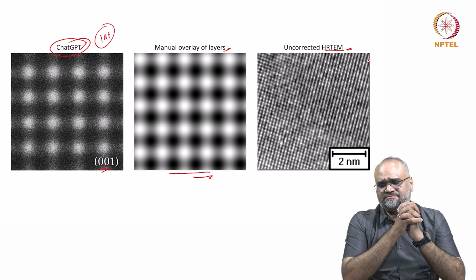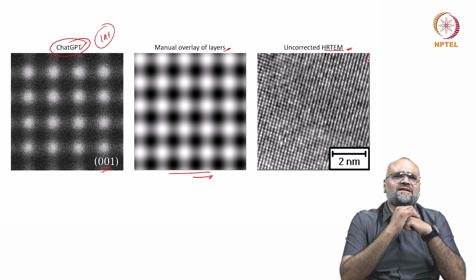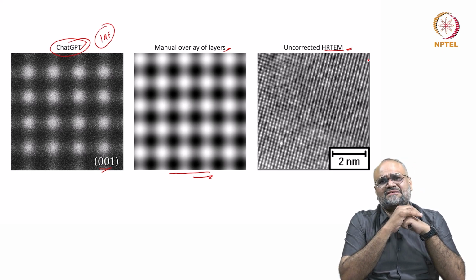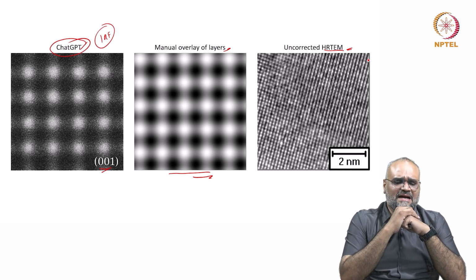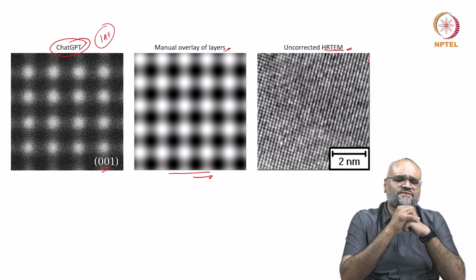You see that there is some kind of a phase modulation happening. If I have an ideal phase object, you really do not see any kind of modulation and you cannot record any intensity variation. And then we had the weak phase object approximation, and then we also had the aberrations due to a lens which can be visualized as a complex number. And if I look at the imaginary part of this complex number, we have something called the contrast transfer function.